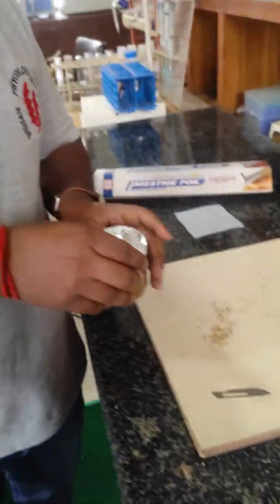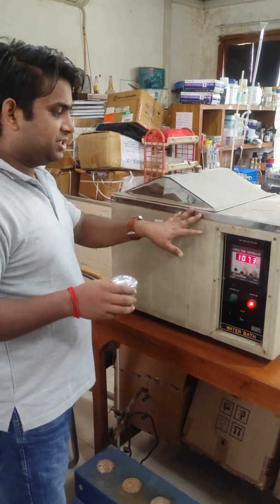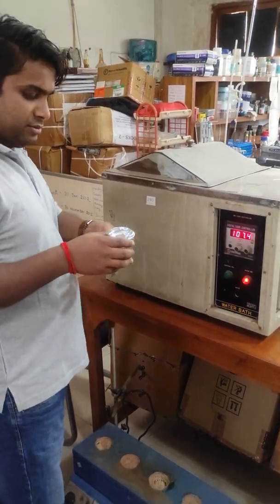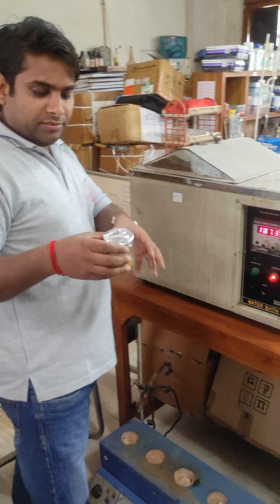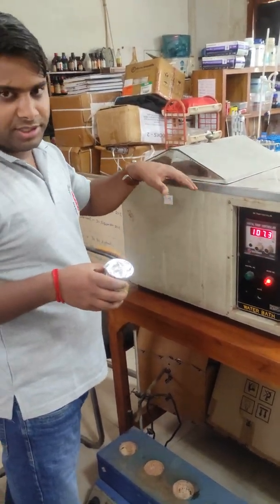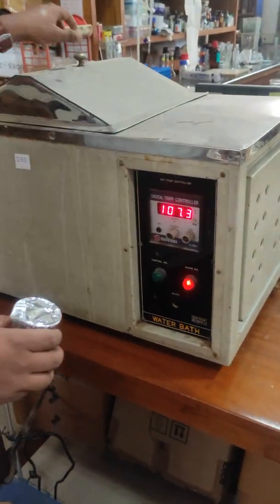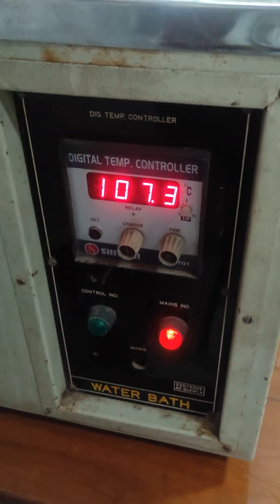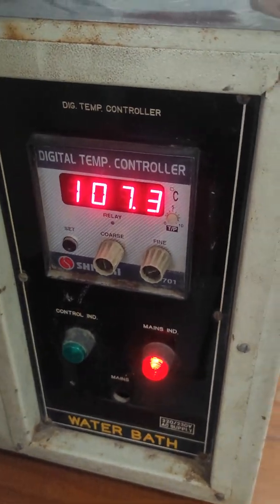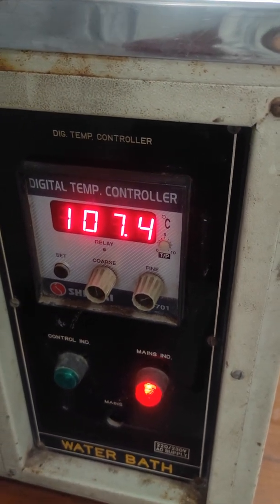Our next step is to incubate the material in a water bath. This is our water bath. Now I am going to incubate this solution which contains 5% NaOH and the thallus at boiling temperature in the water bath. Just keep the material in the water bath and leave for one and a half hours.